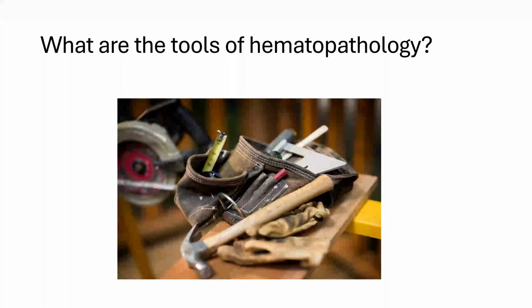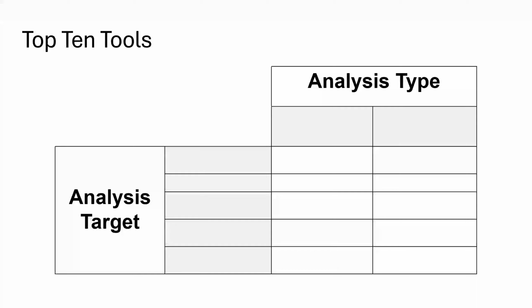This was the challenge from yesterday. What did you find? How did you organize them? Here is my way of organizing the top 10 tools of hematopathology. I've summarized them by analysis target and analysis type.